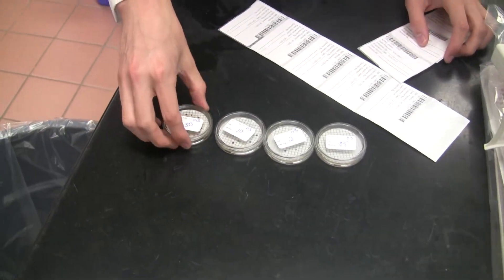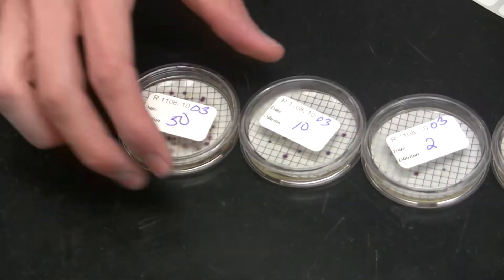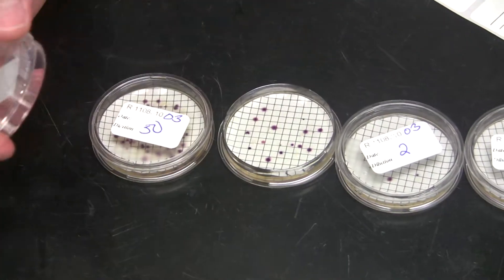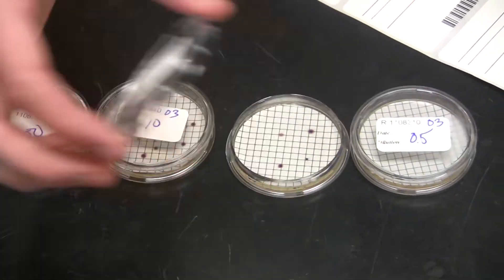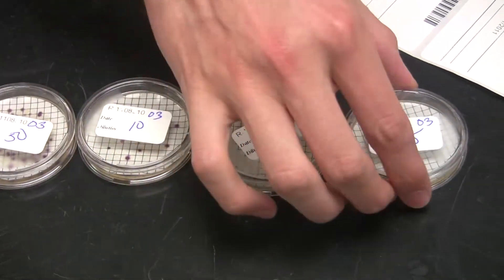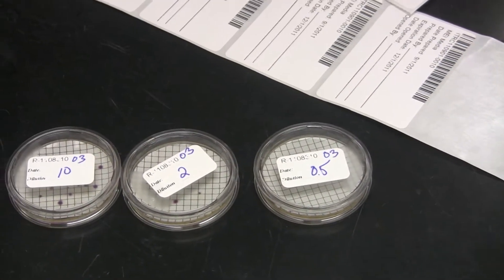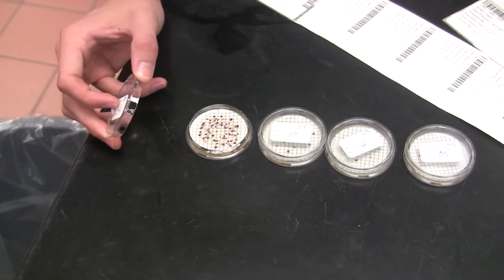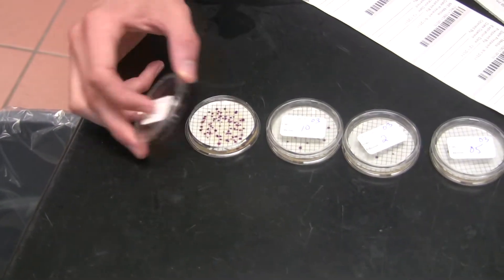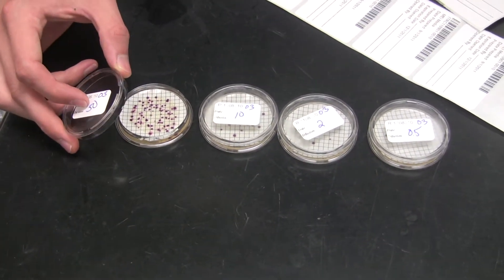We have one of the river samples here. Let's say we put in 50 milliliters. As you drop down and have less and less water sample, the E. coli growth goes down. The numbers refer to the amount of water you're putting in there — correct, we're putting in 50 milliliters here, so obviously you're going to have a lot more bacterial growth.